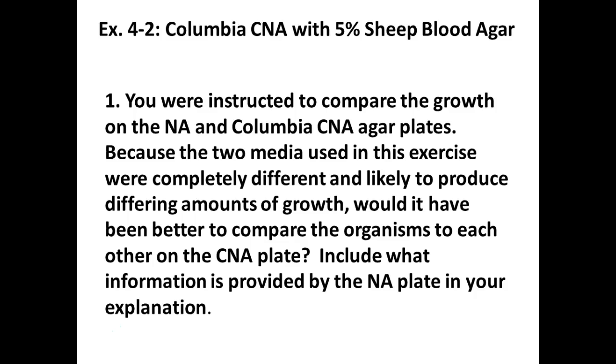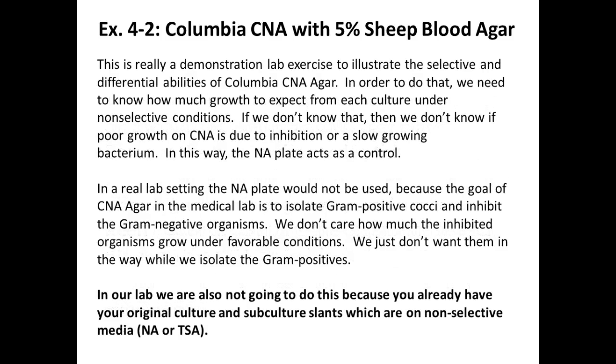Why would we do that? What would they act as? A control, right? And again, your organisms should grow on those plates, no problem. And you guys have been growing on Nutrient Agar and TSA, your growth should be fine. That media doesn't inhibit or change the growth at all.